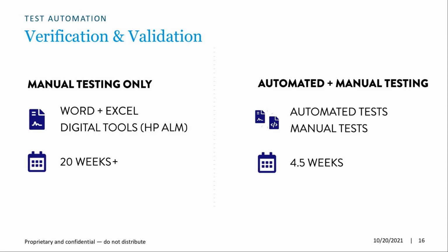And we continued to run test cases as well as do regression testing for the entire QM product, which, once again, if we wanted to break it down to an easy to digest solution, it's about 400 individual applications all working with each other. It's a lot of testing that is done.